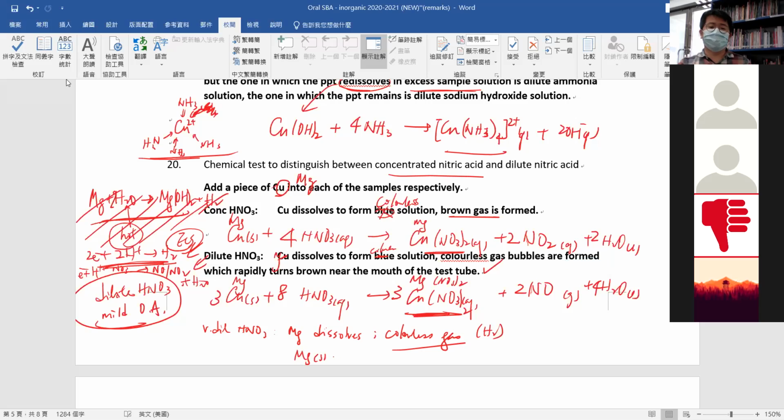It's simply a reaction between an acid and a piece of metal. Do you understand? So this is what I would like to remind all of you. And you use this as one of the acids to be compared with the other. If I change the metal from magnesium to copper, what will happen? If I put it in copper, no reaction.